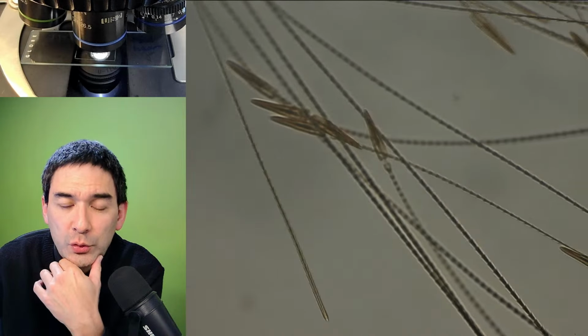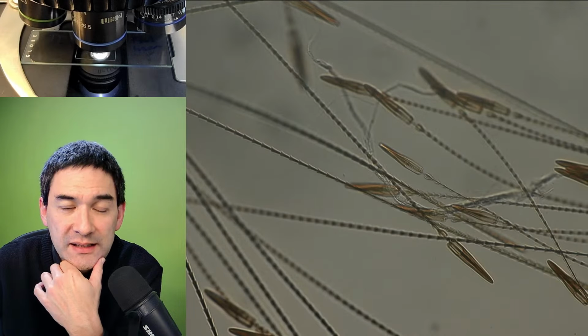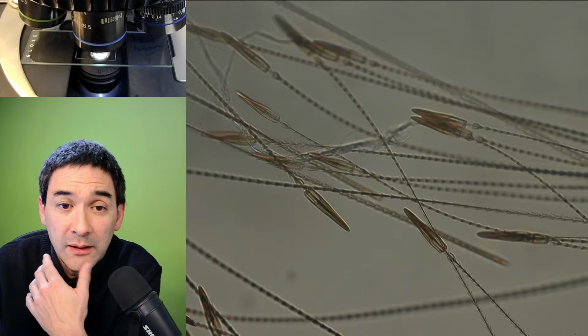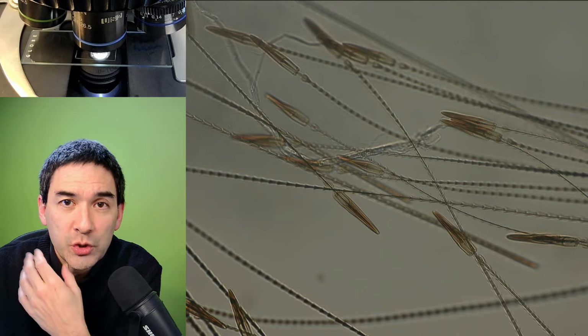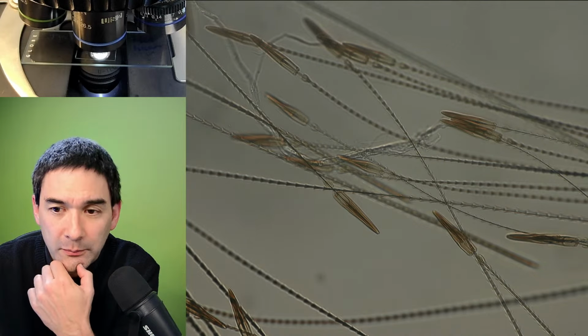For those of you who speak German, these have a very nice name. In German they're called Pfeilhaar. Pfeilhaar means arrow hair, if you translate it. In the German language, sometimes you have very descriptive nouns.